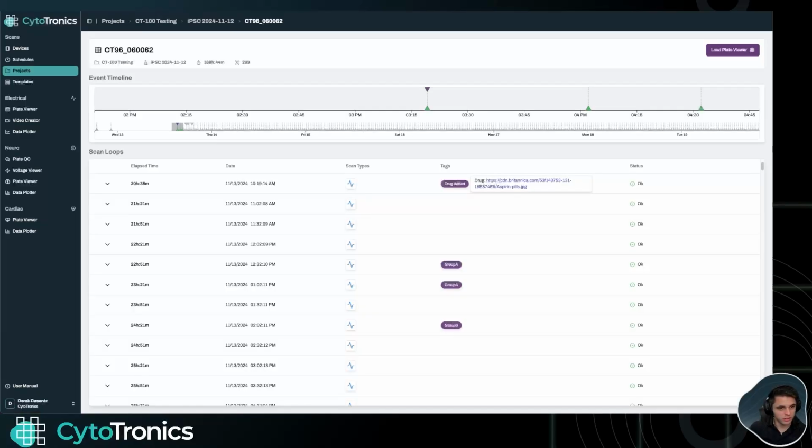I doubt you guys are doing any aspirin stuff, but who knows. This could be a link to anything that bio may want. Maybe it's some type of bio note journal, any type of documentation you have. It doesn't have to be a link, obviously. It can be free form text. Very excited to see how this actually gets used.